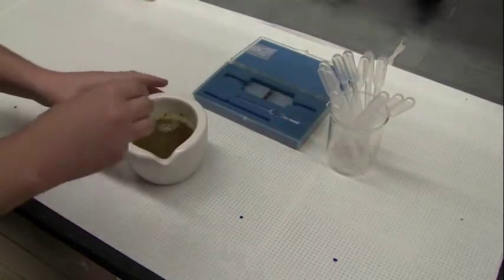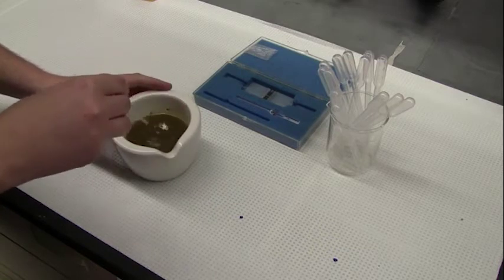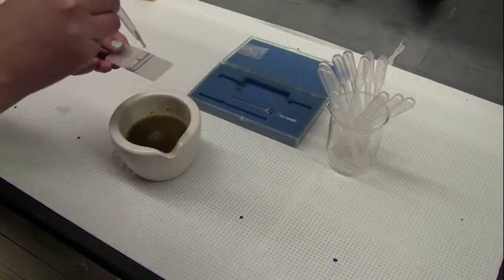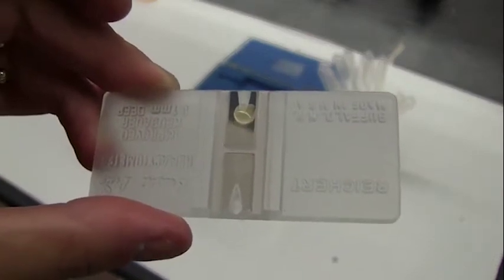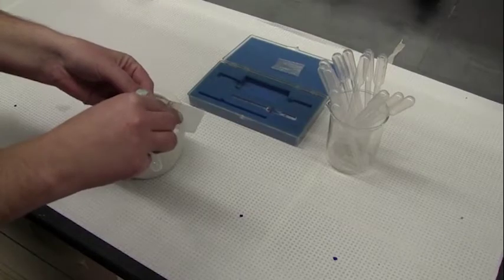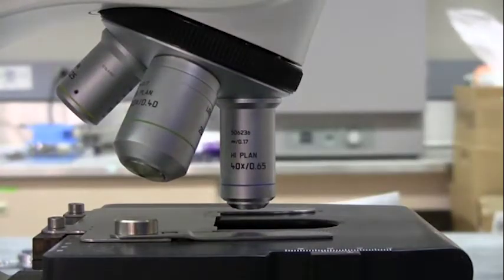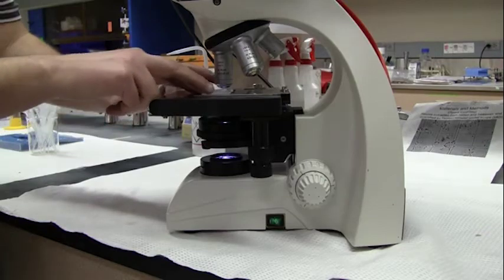Using your disposable pipette, stir and draw up part of the sample. Place one drop onto one of the triangular spots in the counting chamber of the hemacytometer. Carefully place a cover slip over the counting chamber. Turn on the microscope light and set the power to 400 times. Then place the hemacytometer on the microscope and begin to put in focus.